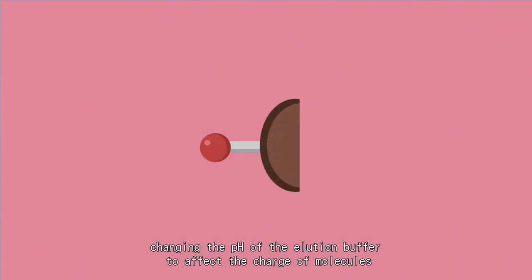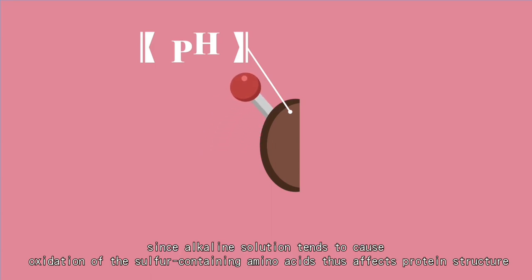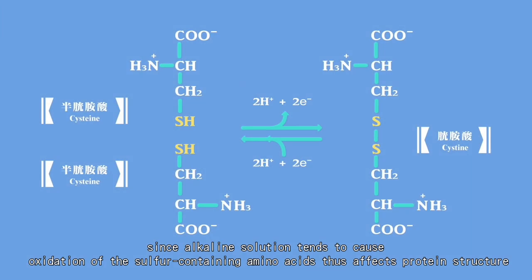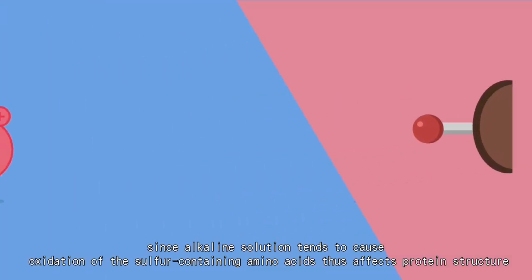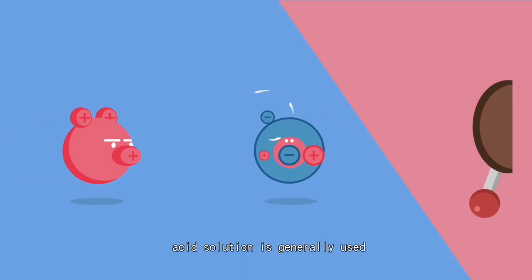Change the pH of the elution buffer to affect the charge of molecules. Since alkaline solution tends to cause oxidation of the sulfur-containing amino acids, thus affects protein structure, acidic solution is generally used. The eluted protein solution is adjusted back to neutral pH immediately upon completion of elution.